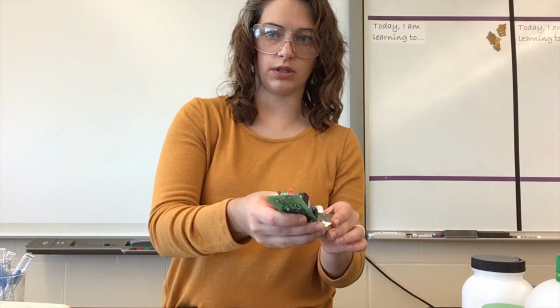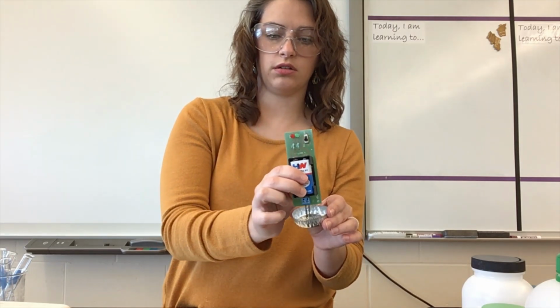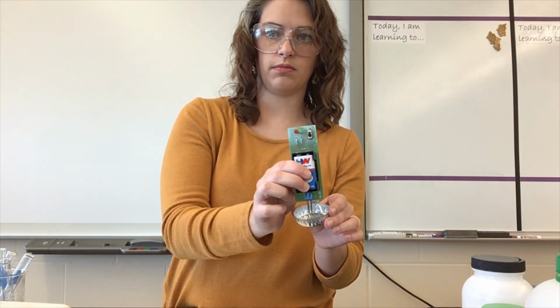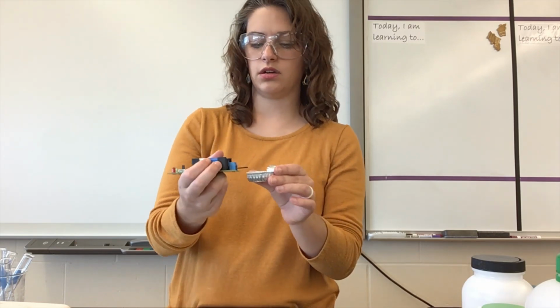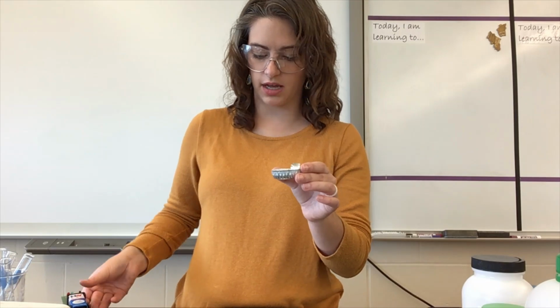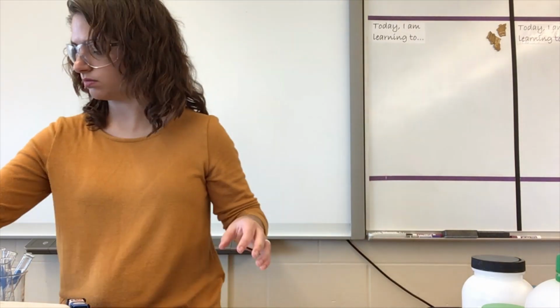Definitely conductive. You can probably see it light up here. Let me see if I can hold it this way. Yep, there's the light. So definitely conductive. Okay, so sodium bicarb is not conductive as a solid. It is conductive in solution.